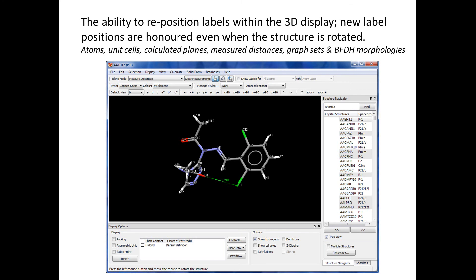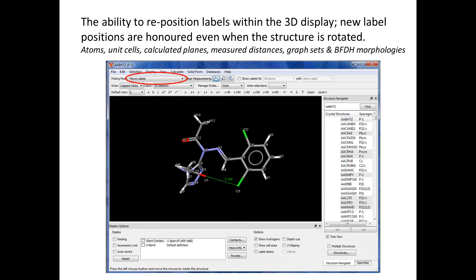Another feature is the ability to reposition labels within the 3D display. These new label positions are honored even when the structure is rotated. If you click here and obtain the menu move labels, you can now individually move all of the labels. You can move the following labels: atoms, unit cells, calculated planes, measured distances, graph sets, and BFDH morphologies.